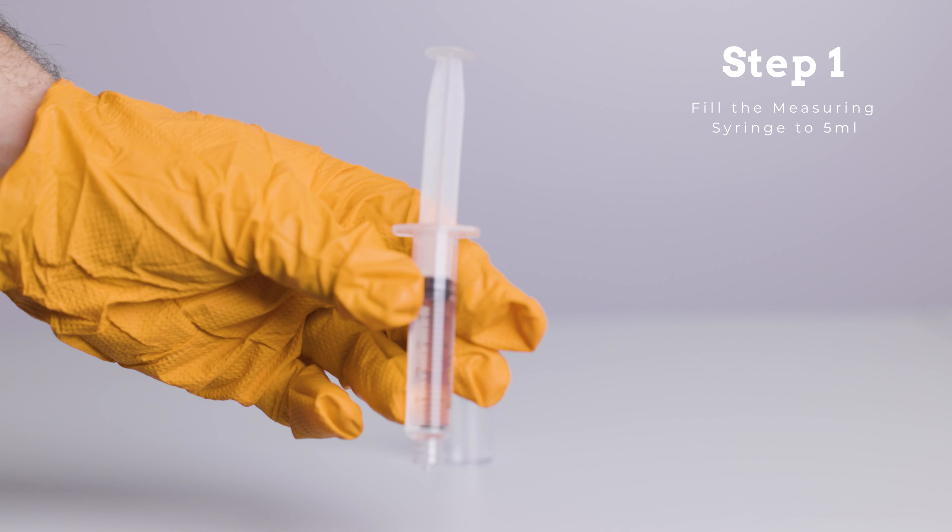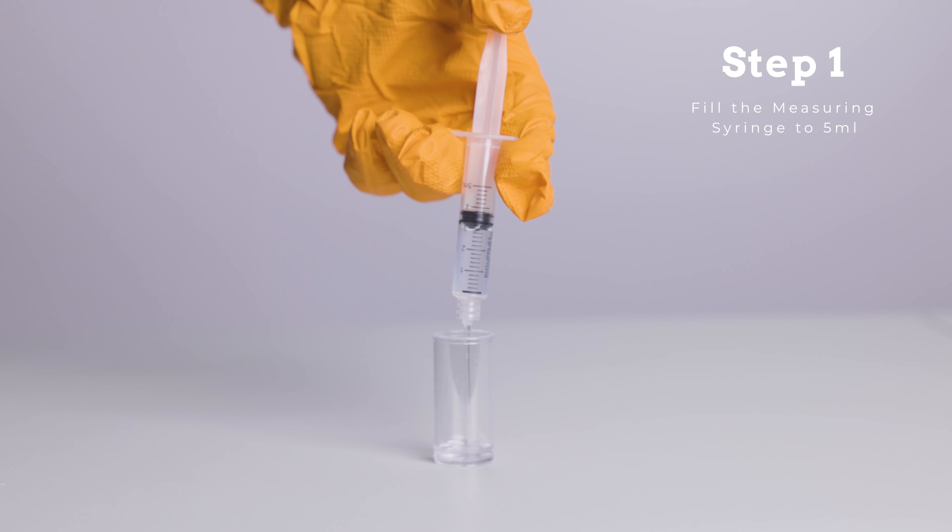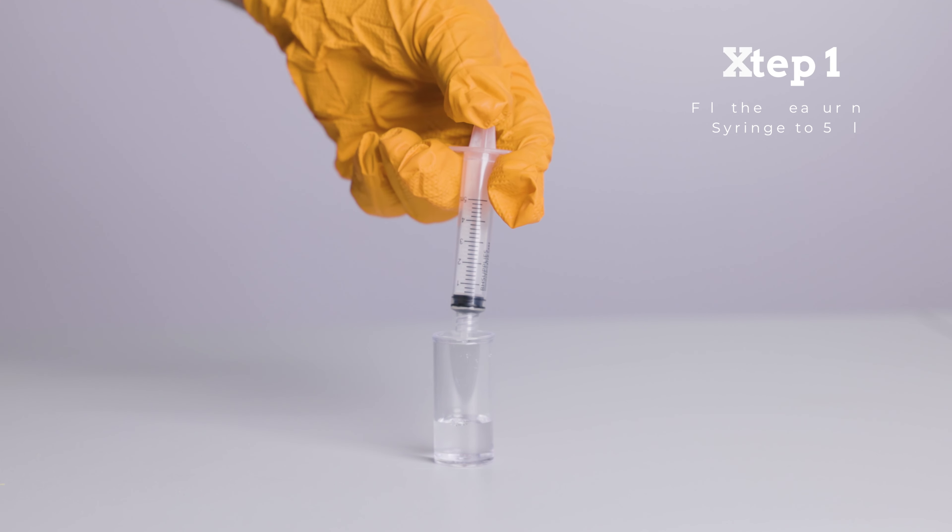Step 1. Fill the measuring syringe with a water sample to be tested to the top of the 5 ml mark, then empty the contents of the measuring syringe into the test box.